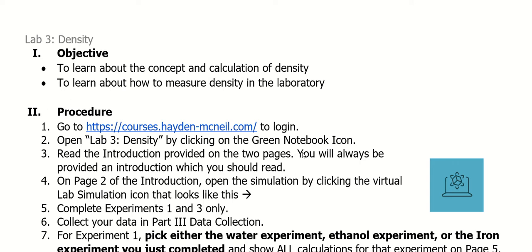In this lab, not only will you revisit the topic of density, because at this point in time, in comparison to lecture, you've already learned about calculating density. You know that density is mass over volume, but you will also learn more about measuring density.